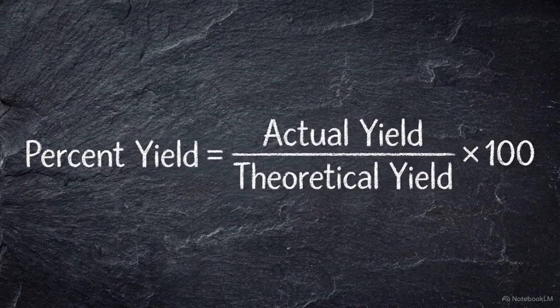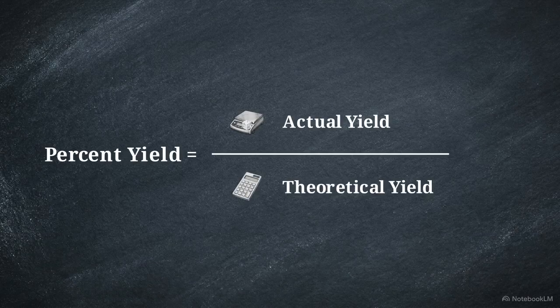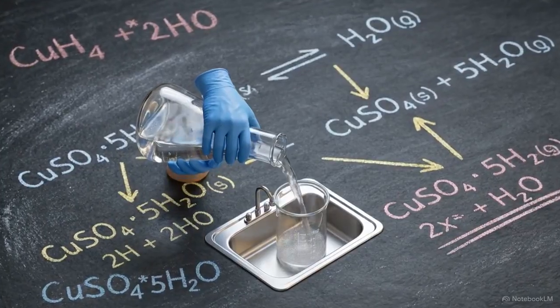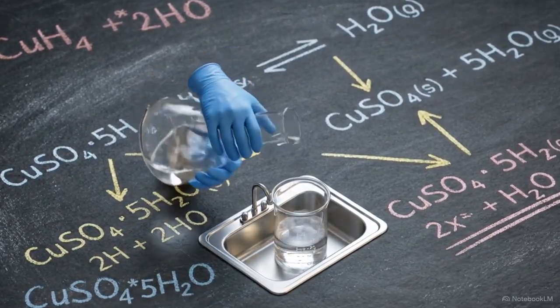This graphic displays the formula for calculating your percent yield. You take your actual physical yield, divide it by the theoretical yield we predicted before the lab began, and multiply by 100. Finally, safely break down your station. Any excess hydrochloric acid must be carefully diluted with plenty of water before being flushed safely down the sink.